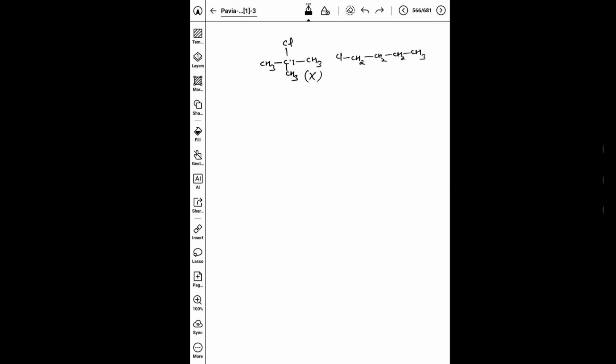So in this case, you will have 3 CH2, right? And how many CH2 are you seeing in the DEPT NMR? Only one CH2. So this possibility is also not possible. So what I am trying to say is the compound with the molecular formula has this structure. I am 100% sure this is the correct structure for the given problem.